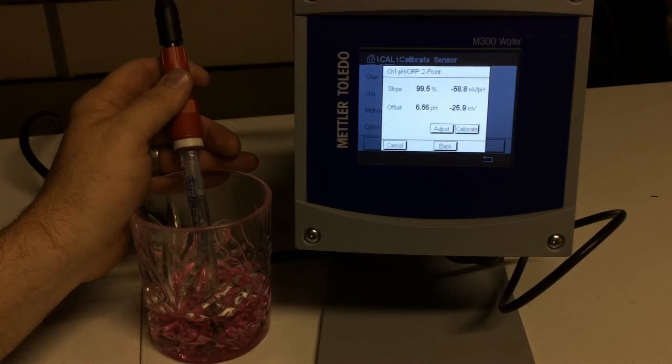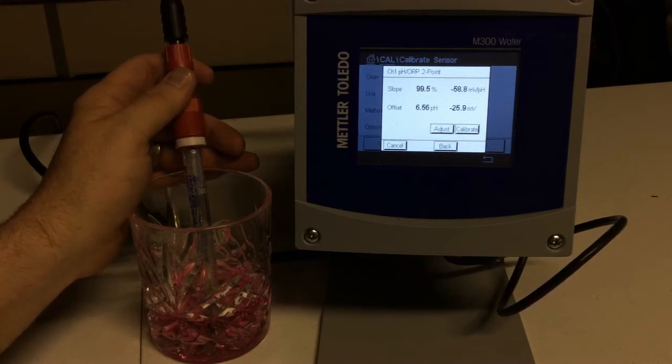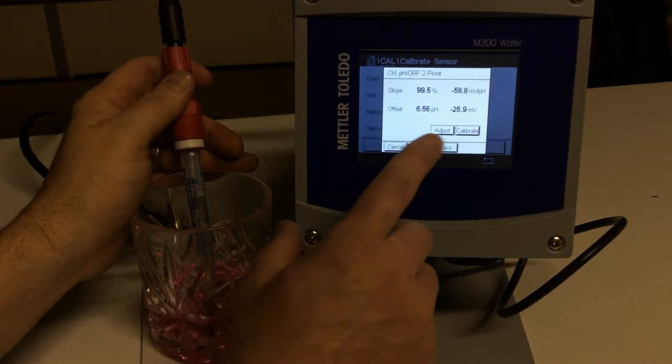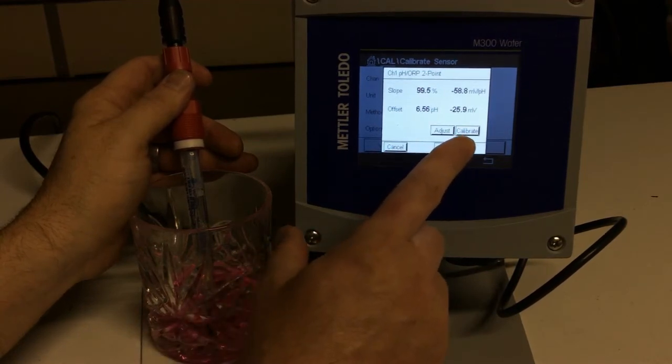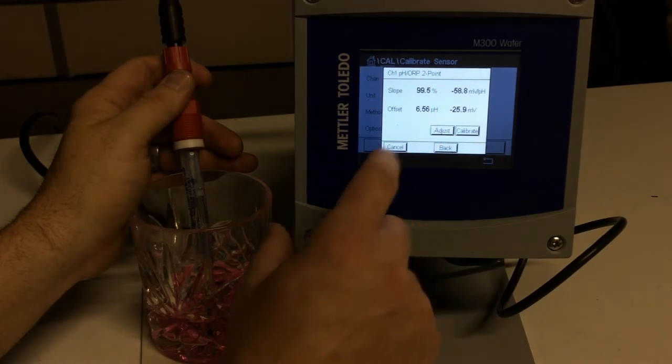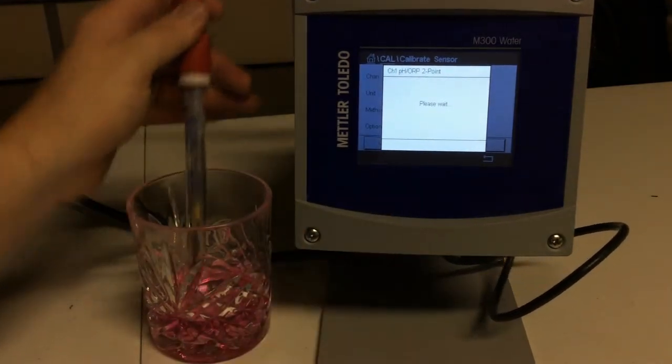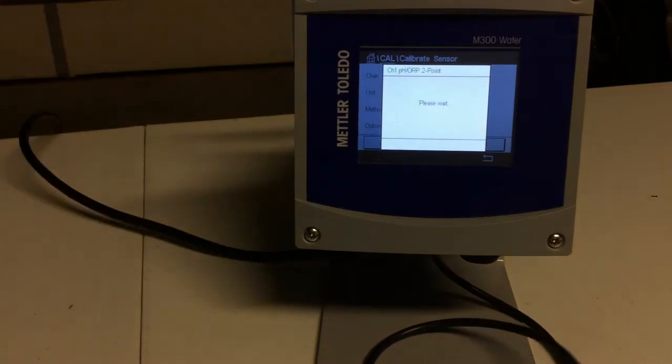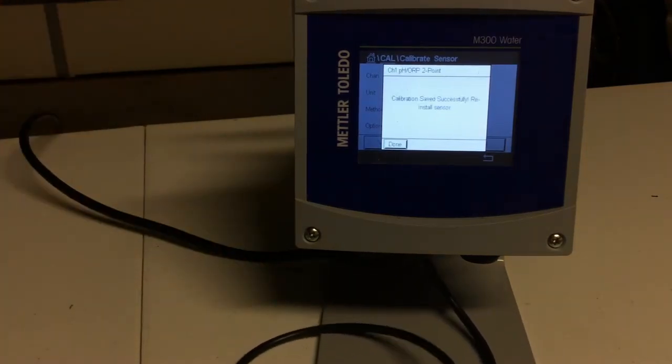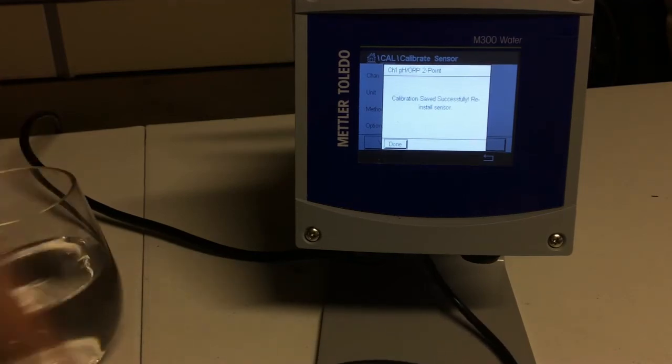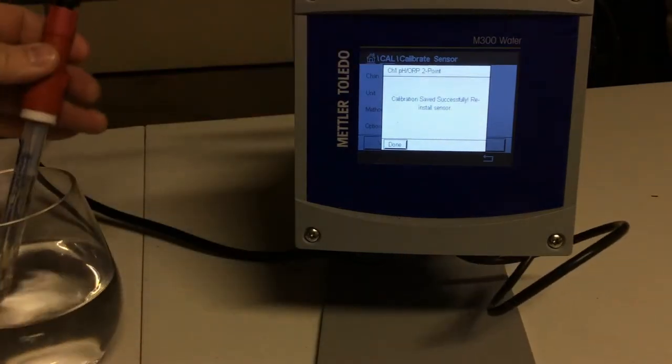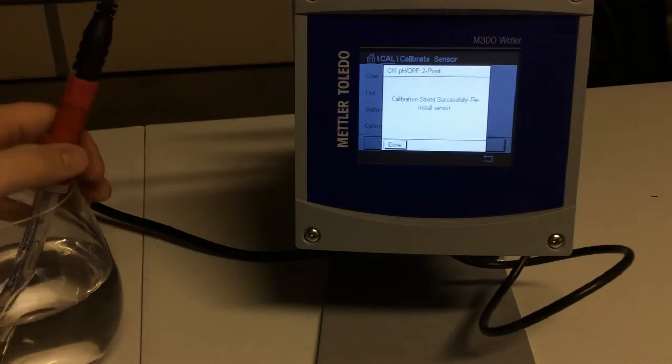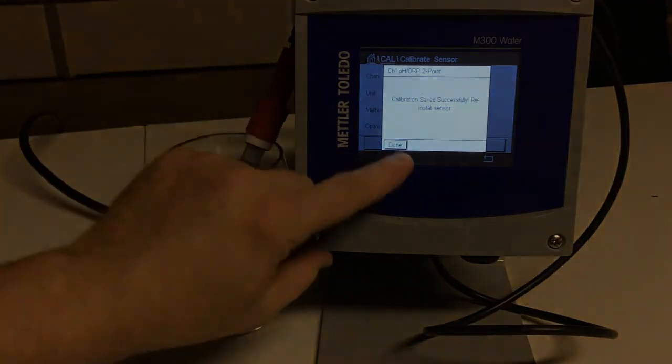So we have finished calibrating to our second pH, and we can see our slope is 99.5, what our offset is. So we have an option of either adjusting or calibrating the sensor. If you calibrate, you're going to calibrate the sensor. If we adjust it, we're going to adjust the sensor to the calibration that we just did. That way we make sure we're getting accurate readings out in the field. And so as it is adjusting the sensor, it is now telling us the calibration has been saved successfully and to reinstall the sensor. And we have done that. And that is how you calibrate your sensor, using the transmitter out in the field.